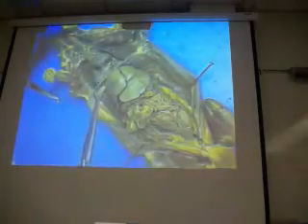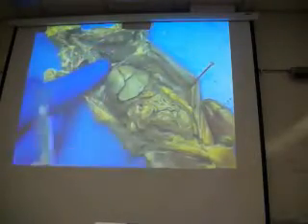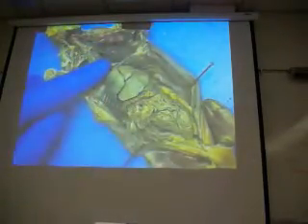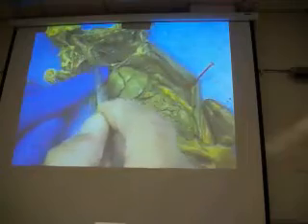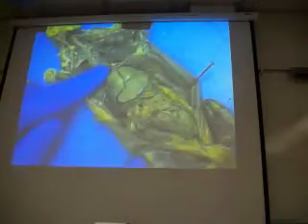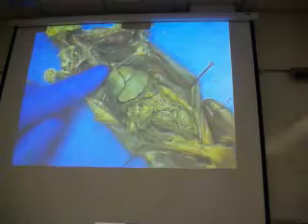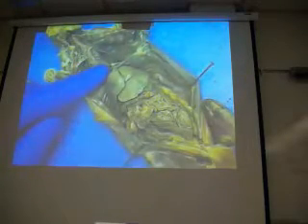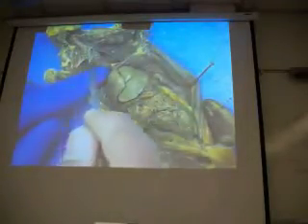Now, one of the things I'll talk about first is this structure right here. So in the thoracic cavity, sitting on the ventral surface of the heart, okay, is this gland right here. Okay. This is the thymus gland. So the thymus gland, that's responsible for T cell maturation. Right. So those T lymphocytes, they mature right here. Okay. So make sure you guys know that.